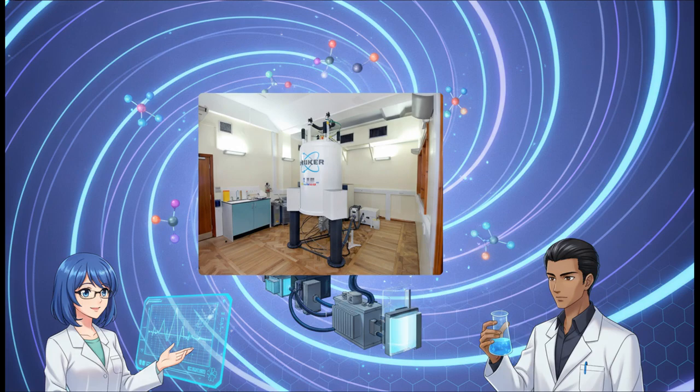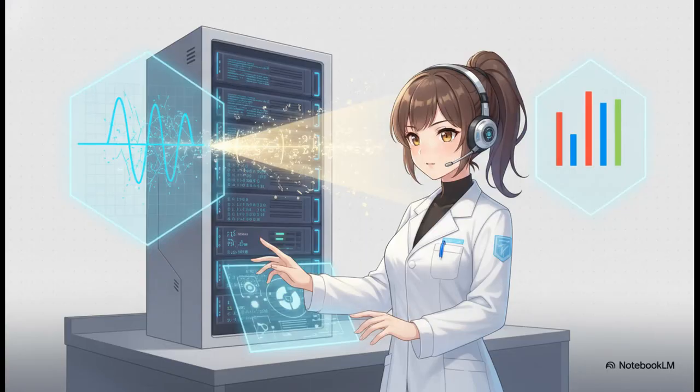And these incredible machines are a sight to see in a modern university or research lab. The main piece is this huge cylindrical tank that houses the superconducting magnet itself. And to keep that intense magnetic field perfectly uniform, the internal coils have to be constantly bathed in liquid helium and liquid nitrogen. I mean, we are talking about a very serious, highly demanding piece of hardware here just to uncover these molecular structures. But here's the thing. The raw signal that this machine picks up, that free induction decay, is honestly just a chaotic, overlapping mess of waves decaying over time.